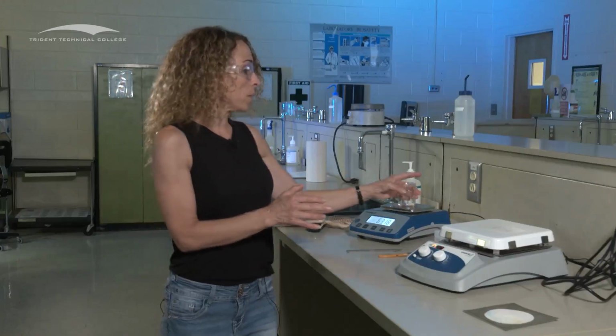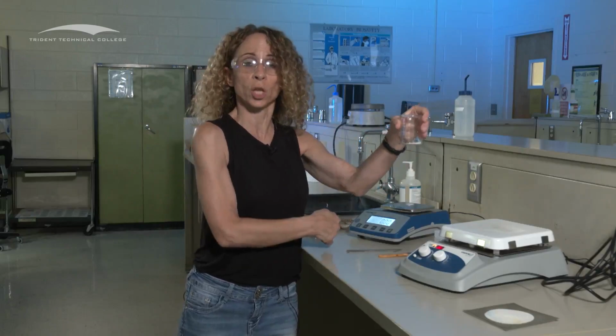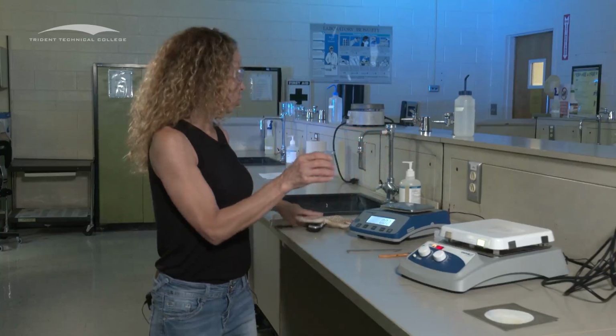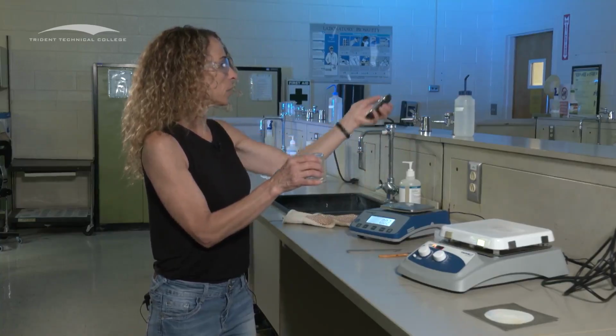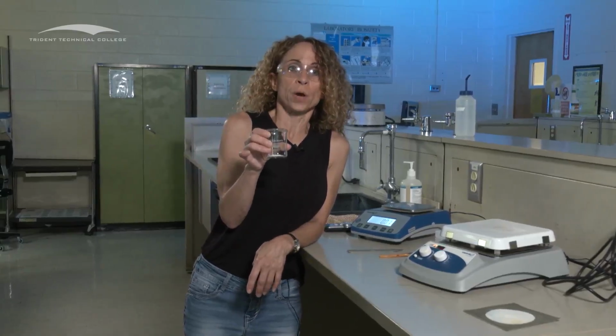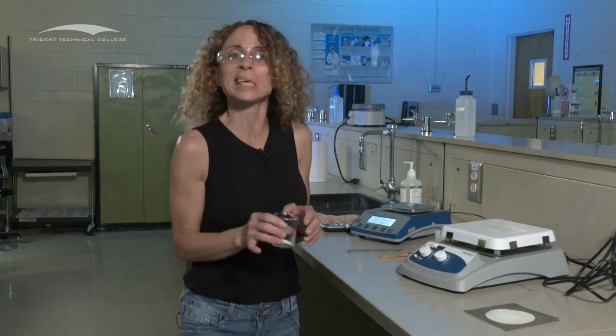Now, to make sure that we are ready to go, you need to do what? To make sure we've gotten all the water off of this, or my chemical reaction has gone to completion, you're going to compare the two weights that you just took, as shown on this slide. You're going to take the difference. If the difference is more than 0.01 gram, we cannot say that we have a completely dry alum product. We cannot say that the baking soda has been completely decomposed. So we are going to carry on and do it again.